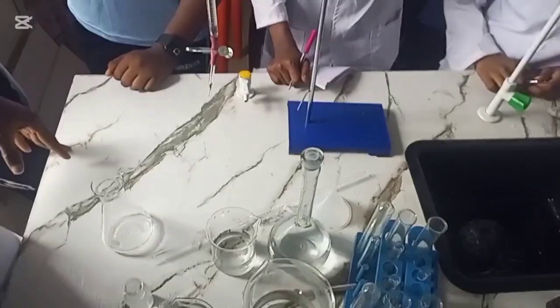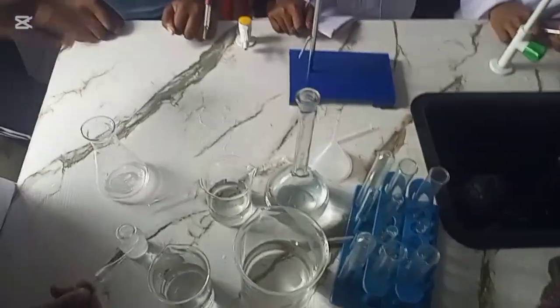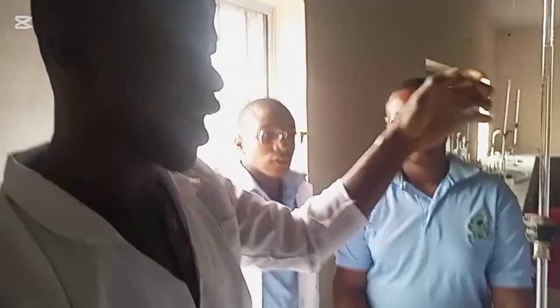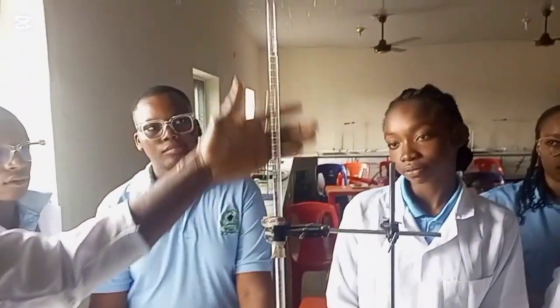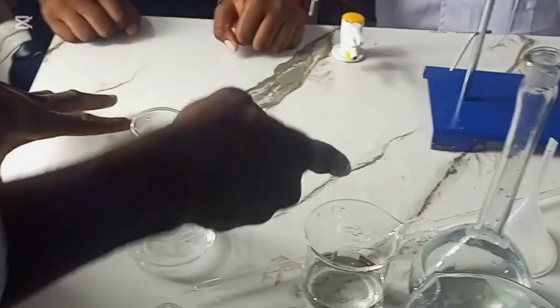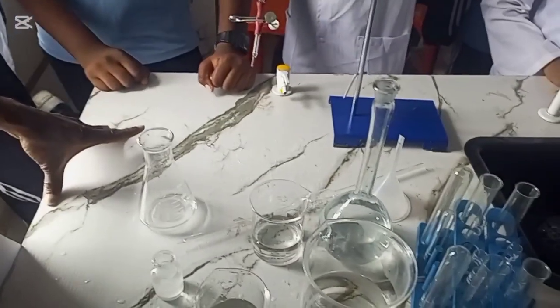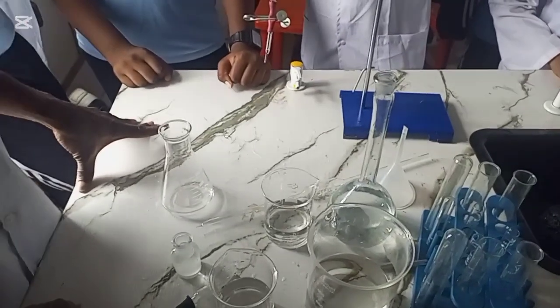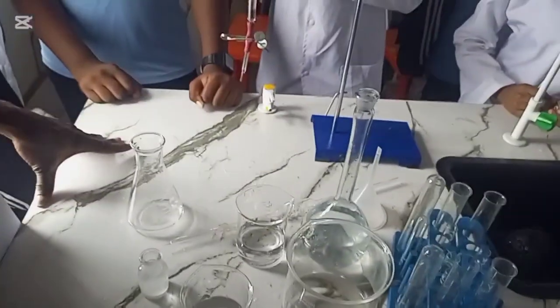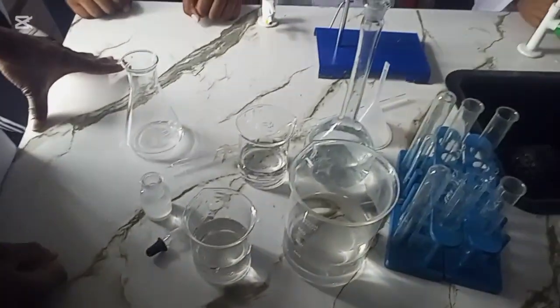I can do it. Okay, so what do we have in the burette? We have our acid. The acid goes to the burette. Is it making sense? As you watched, you see that I didn't draw up the acid. Rather, what I drew up was the base. We are not to drink it, so you spit it out and rinse your mouth. There will be no harm.